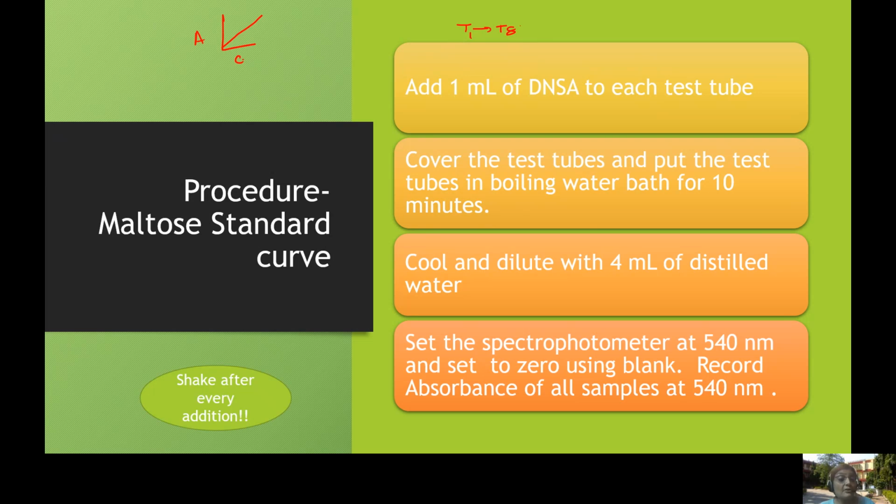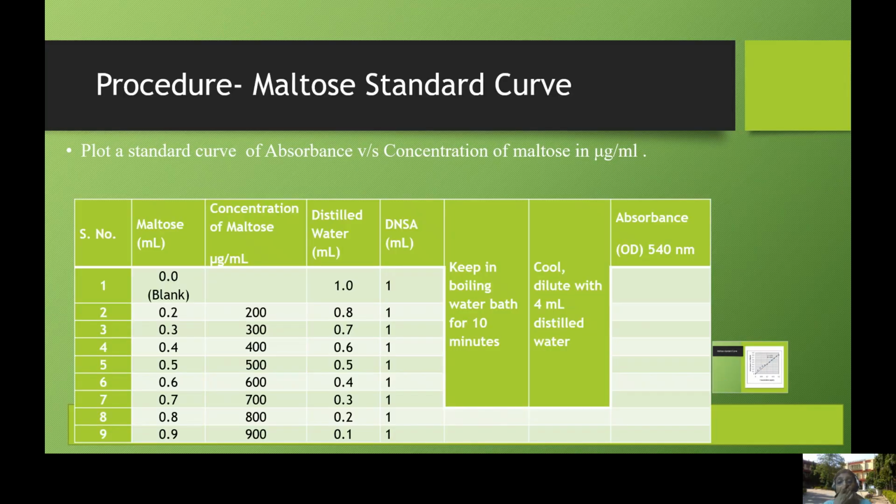Of course, I have told you last time also, when we were discussing Lowry's method, that after every addition it is very important that you shake and mix the contents before keeping them back in the test tube stand. Okay. So that is how your table will look.